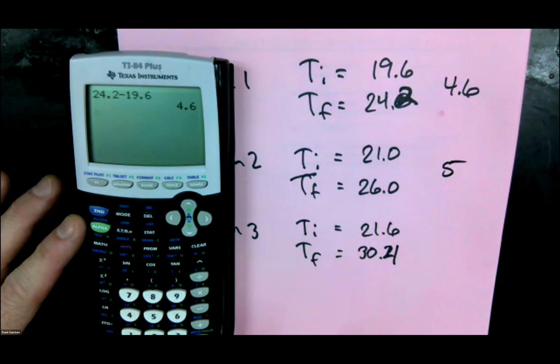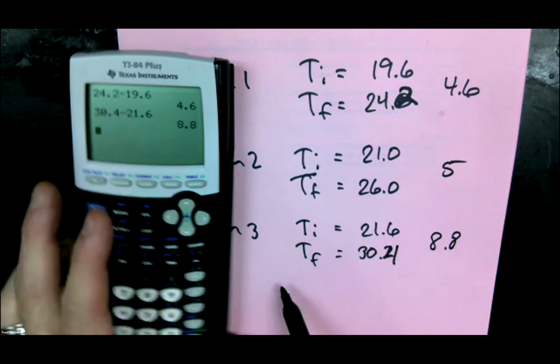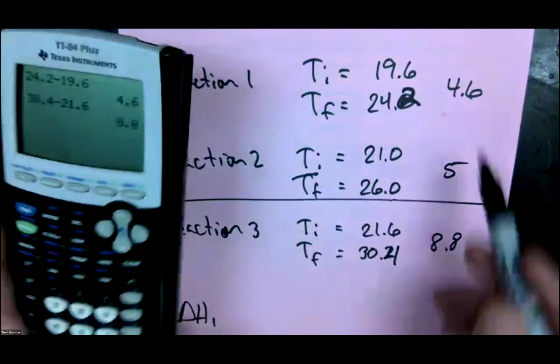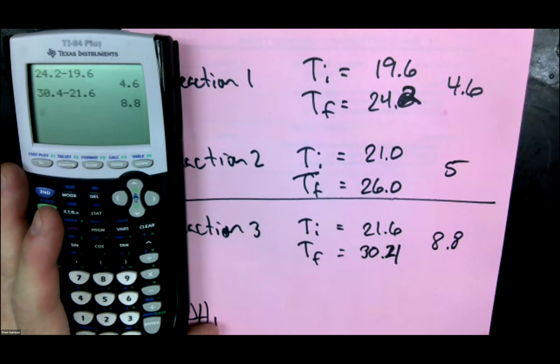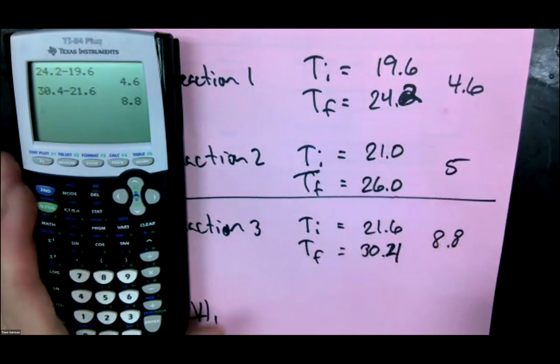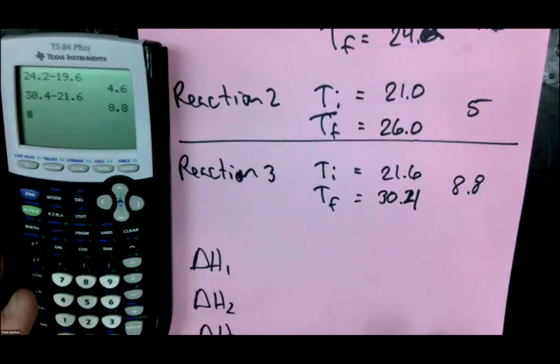This is 5, and this went up actually to 30.4 in the last seconds as I was unplugging it. This is 8.8. Now, roughly, those two are supposed to equal this one. Temperature is not necessarily summative in this case, but it's going to be close. You notice they're pretty close, 9.6, 8.8. We're pretty close there, so our error is not going to be too bad.